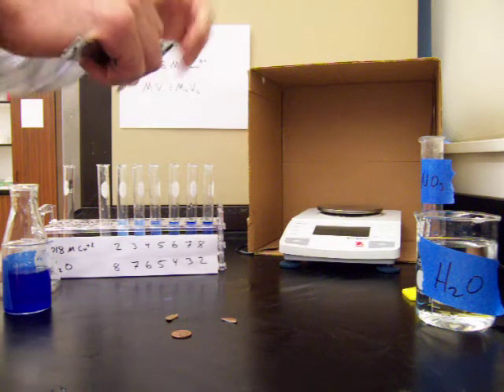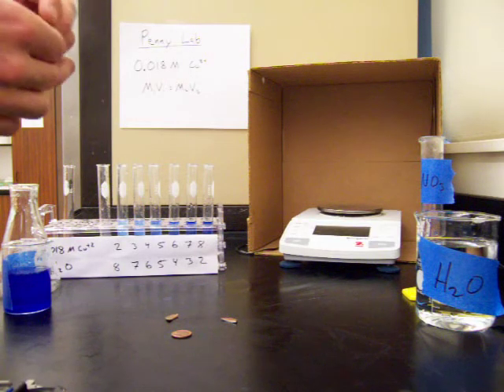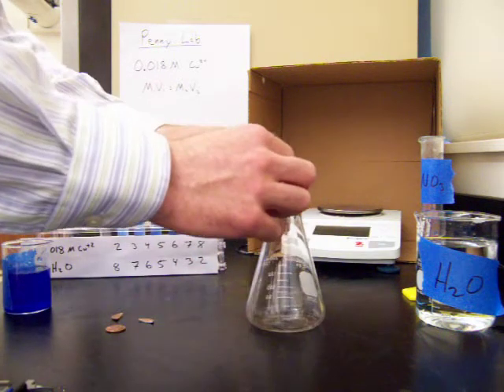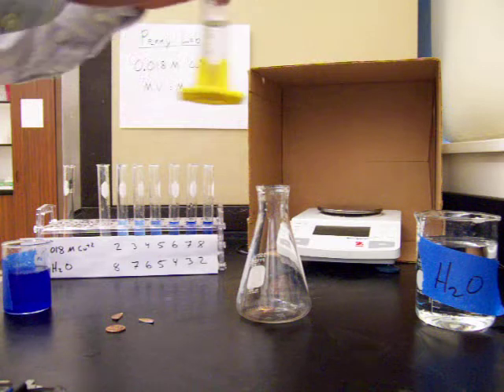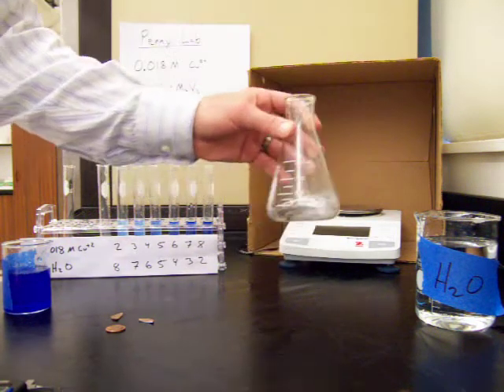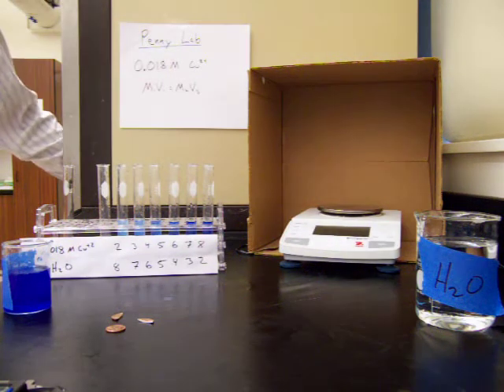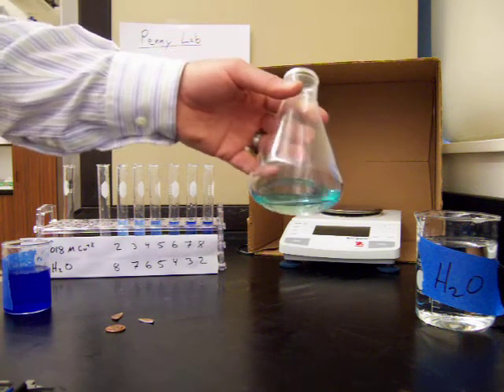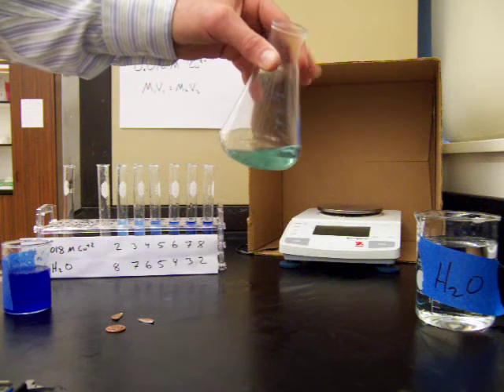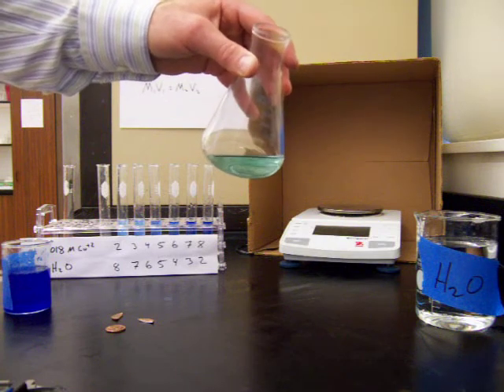Now we want to dissolve the penny in nitric acid. We'll put our penny in a flask and add nitric acid inside the fume hood, because the gas produced by the reaction of nitric acid and copper is harmful to breathe. After the penny completely dissolves overnight, it makes a solution with a slight blue color. The blue color comes from copper ions, which produce a bluish-green solution when dissolved in water.